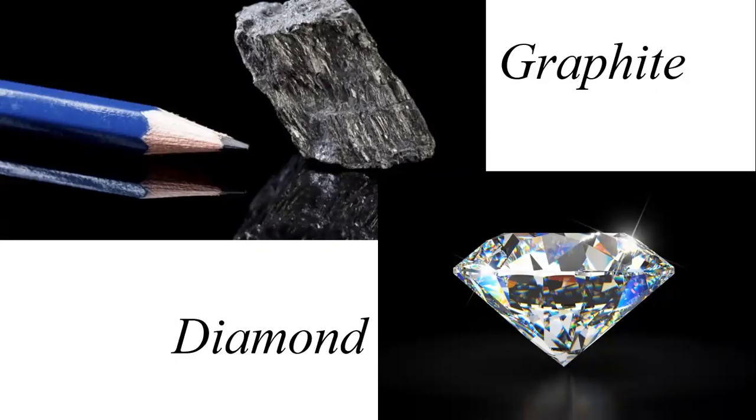All substances produce a characteristic diffraction pattern. X-ray diffraction discloses the presence of a substance as its existing form, not in terms of the constituting elements. This is the reason why graphite can be differentiated from diamond by the diffraction method, even though both consist of carbon. So if graphite is made of carbon and diamond is also made of carbon, we can differentiate both of these compounds by X-ray diffraction. That is one example in which we can apply it.